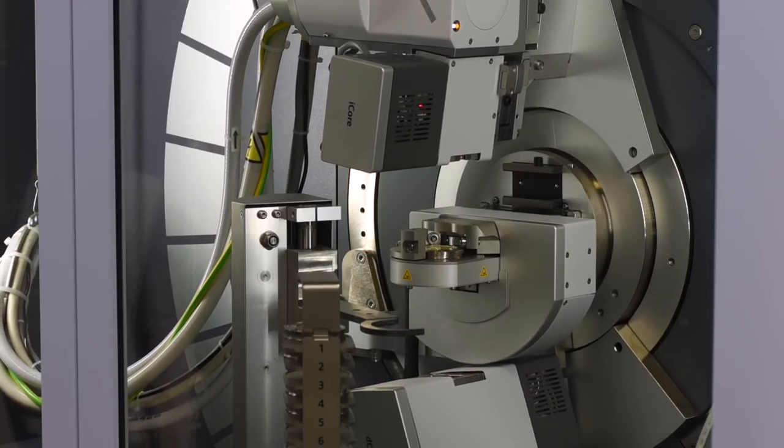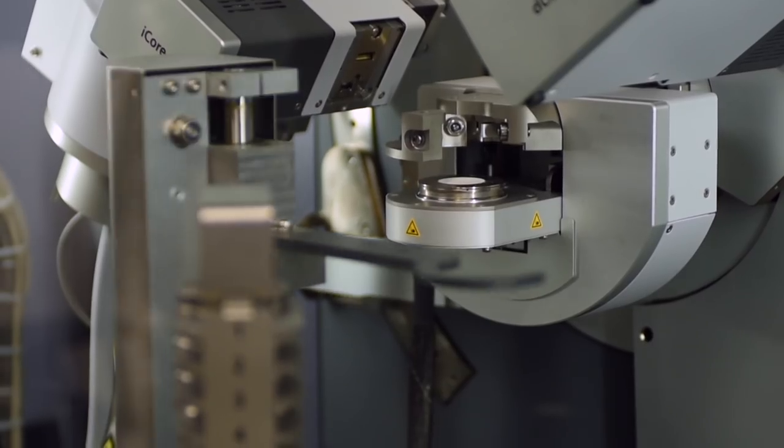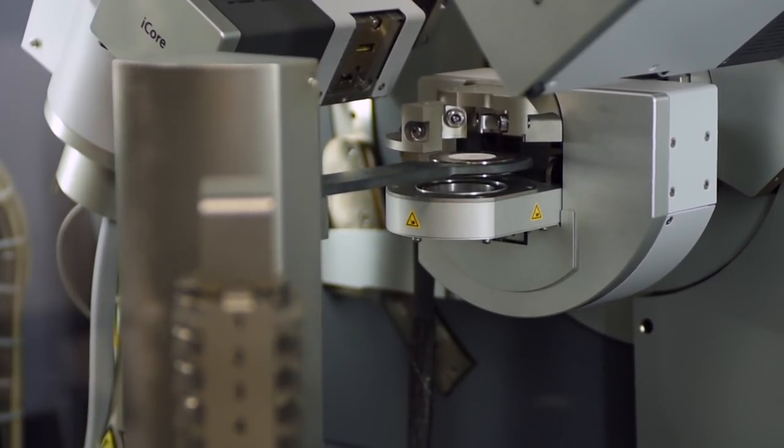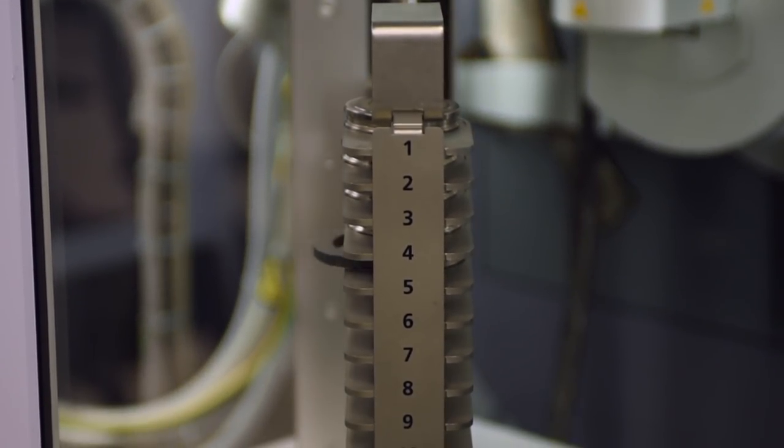The new measurement programs combined with the automated data collection and the possibility to generate automated analysis scripts provide you with a fully automated solution for your x-ray diffraction measurements.